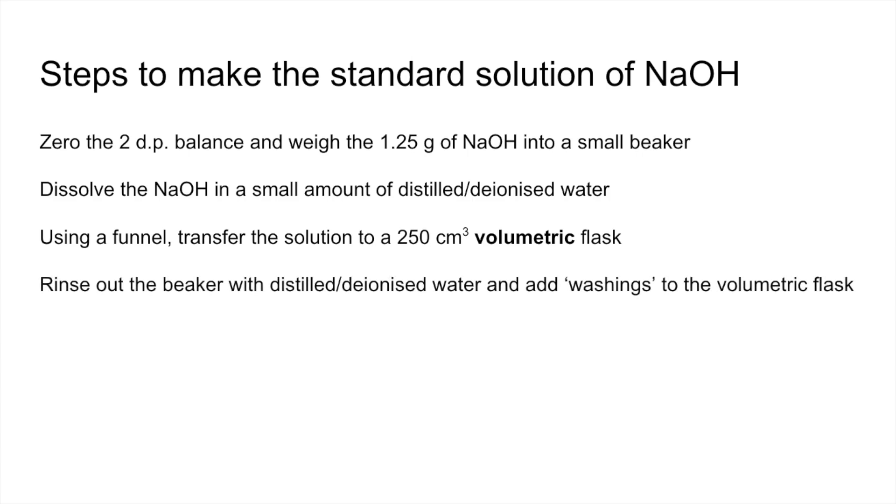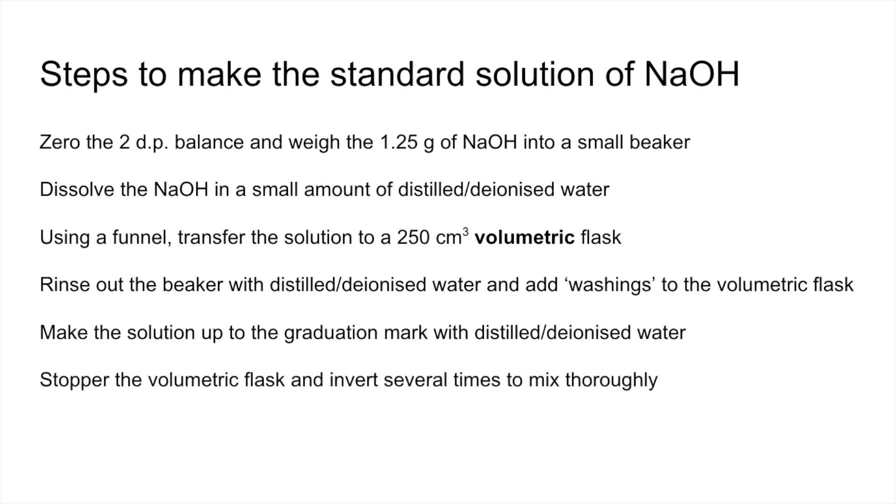I'm going to rinse out the beaker and add the washings to the volumetric flask, and then we're going to make the solution up to the graduation mark. And then the final thing we do is just stopper the volumetric flask and invert it several times to mix it thoroughly.